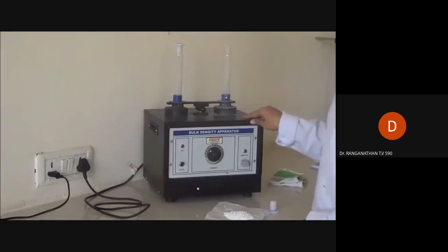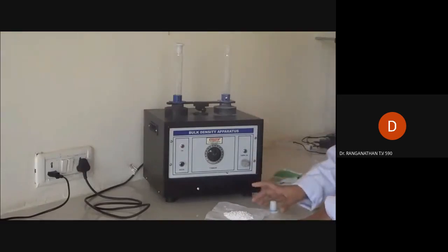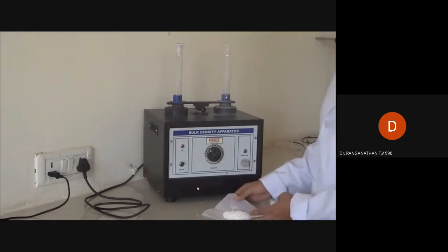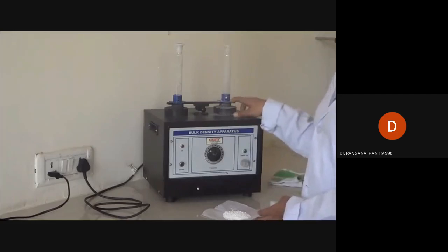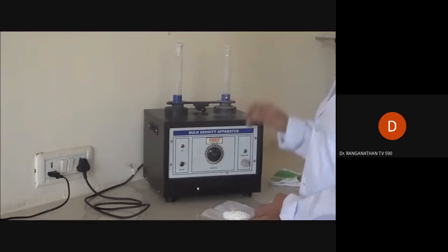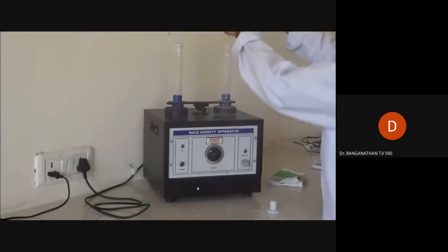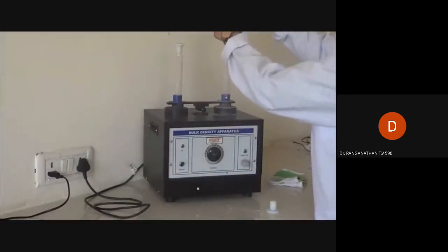Now for bulk density, we first weigh the sample of the powder. So here I have already weighed powder, that is 16 gram. Now we will transfer this powder into the measuring cylinder and check the bulk volume. So the volume is checked first, untapped volume as we call it.